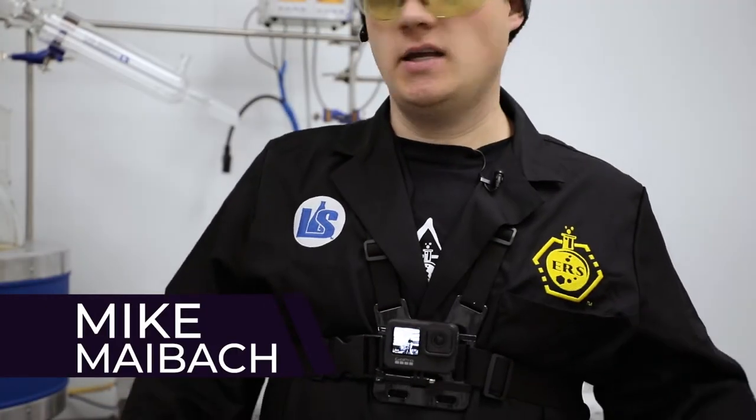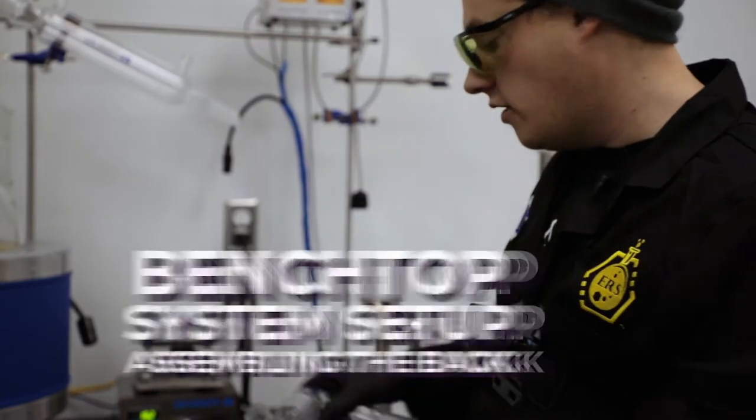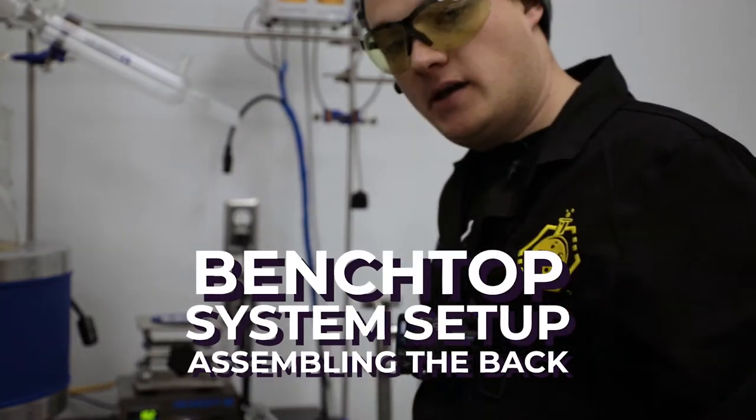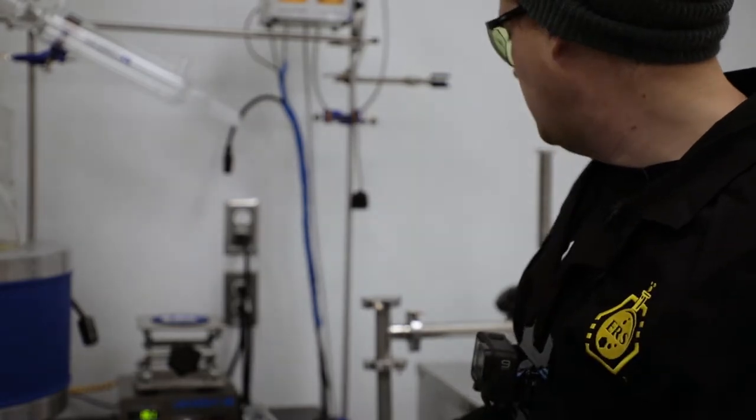Happy Wednesday! This is Mike here with Lab Society and we are in the R&D lab. Today I'm going to go over how to assemble the backside of the G3X system from condenser through to the cold trap.